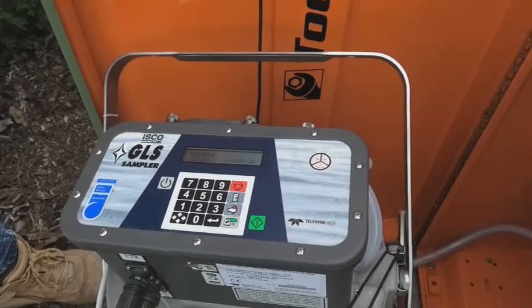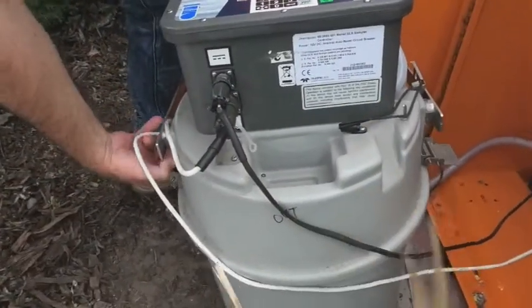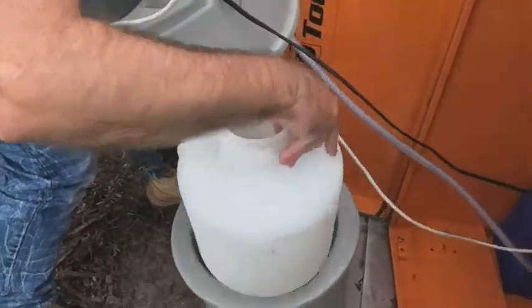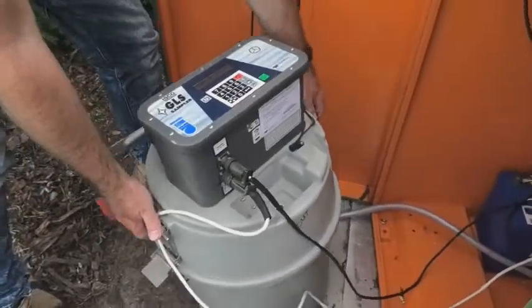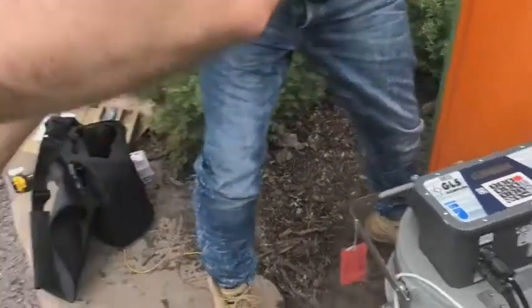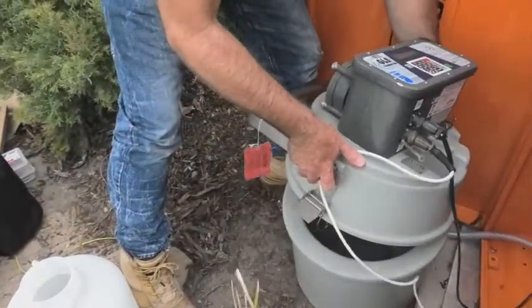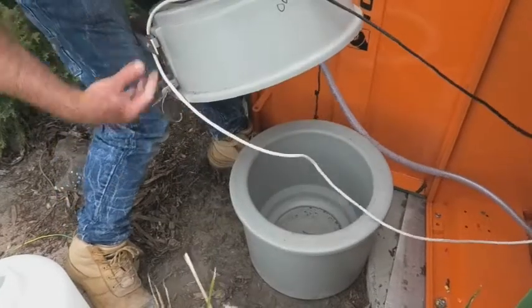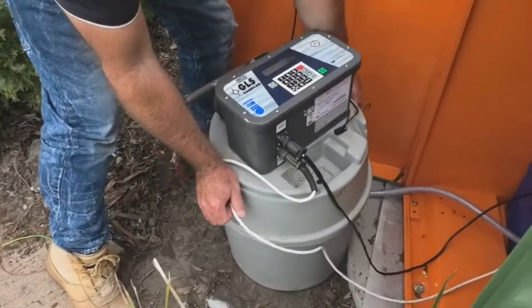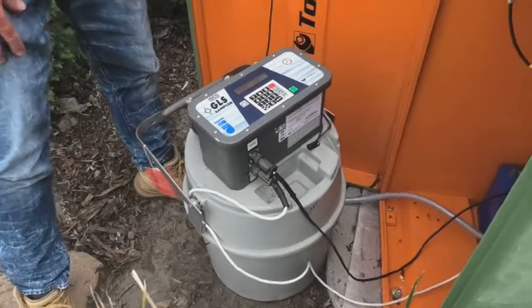So this would be the point at which you would then open the sampler. Take your bottle out and you could put all of your sample then into your sample bottles. Rinse the bottle out, make sure it's empty and dry as best you can, and then put the sampler bottle back in there. Now depending on your process, sometimes you may actually take those sampler bottles away and replace with a new bottle, otherwise you just replace the clean bottle back in there.